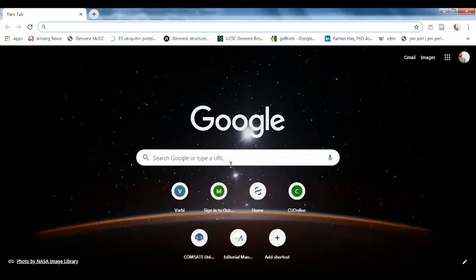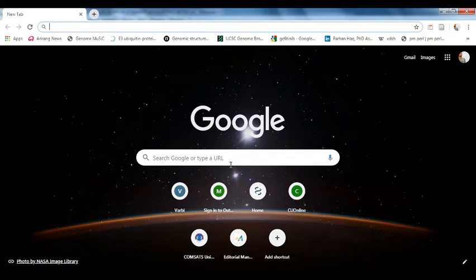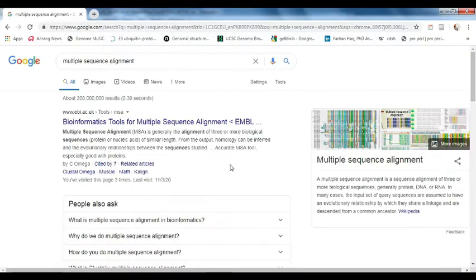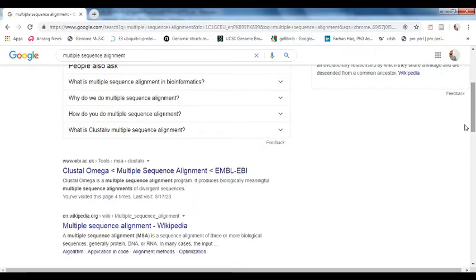This tutorial is about performing multiple sequence alignment using protein sequences and then generating a phylogenetic tree to show the relationship between those sequences. Multiple sequence alignment means that we use more than two sequences, align them, and find any conserved sites between the sequences. We will use the most widely used method available online, covering the basics of multiple sequence alignment and phylogenetic trees.